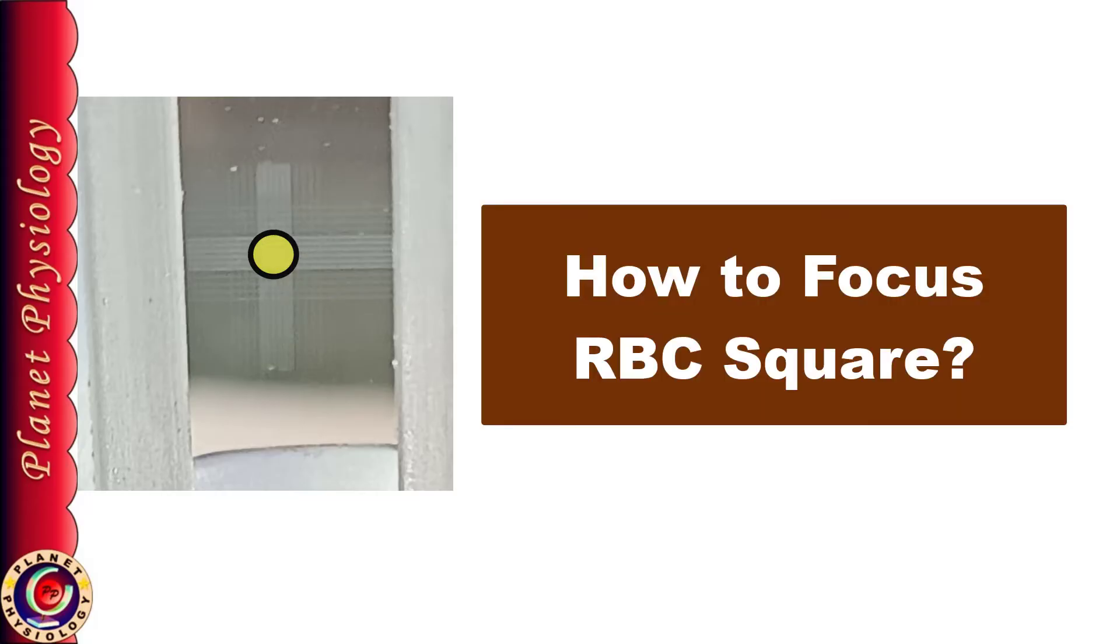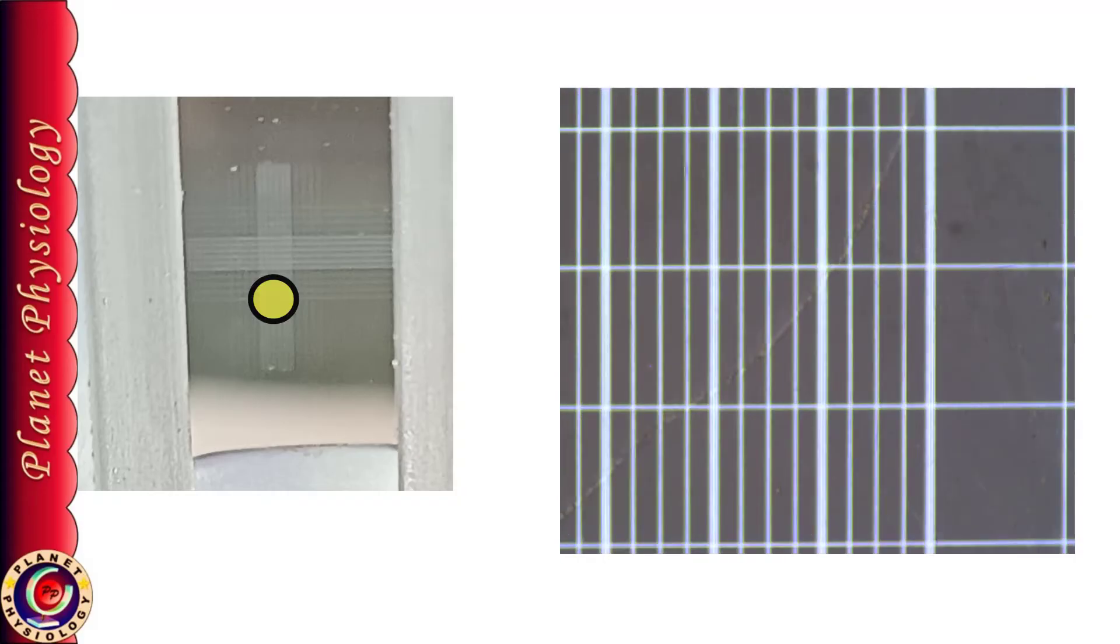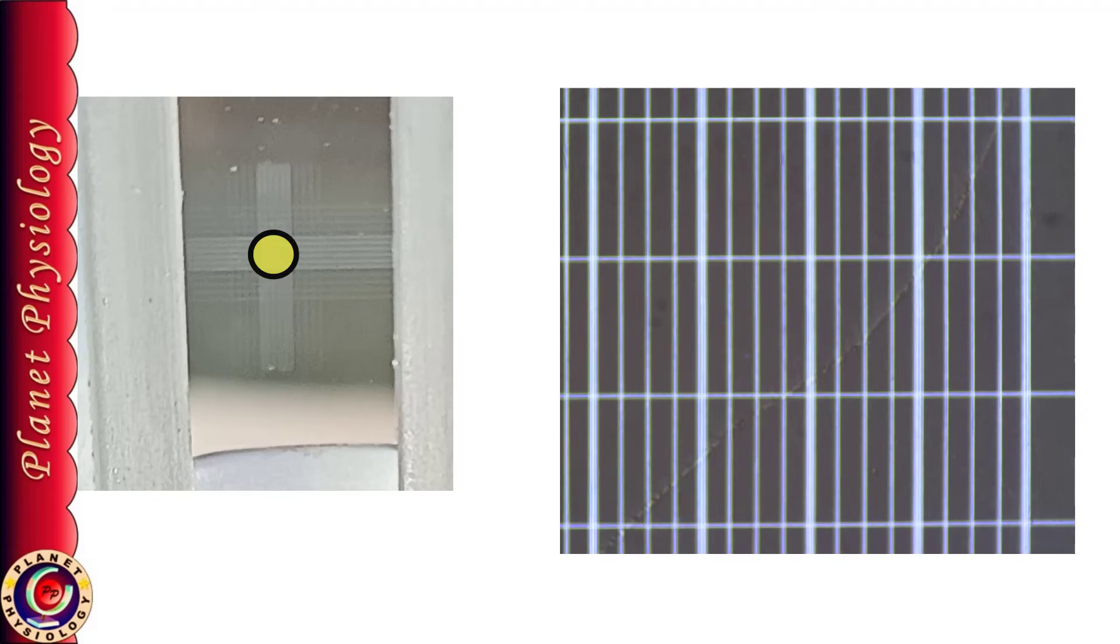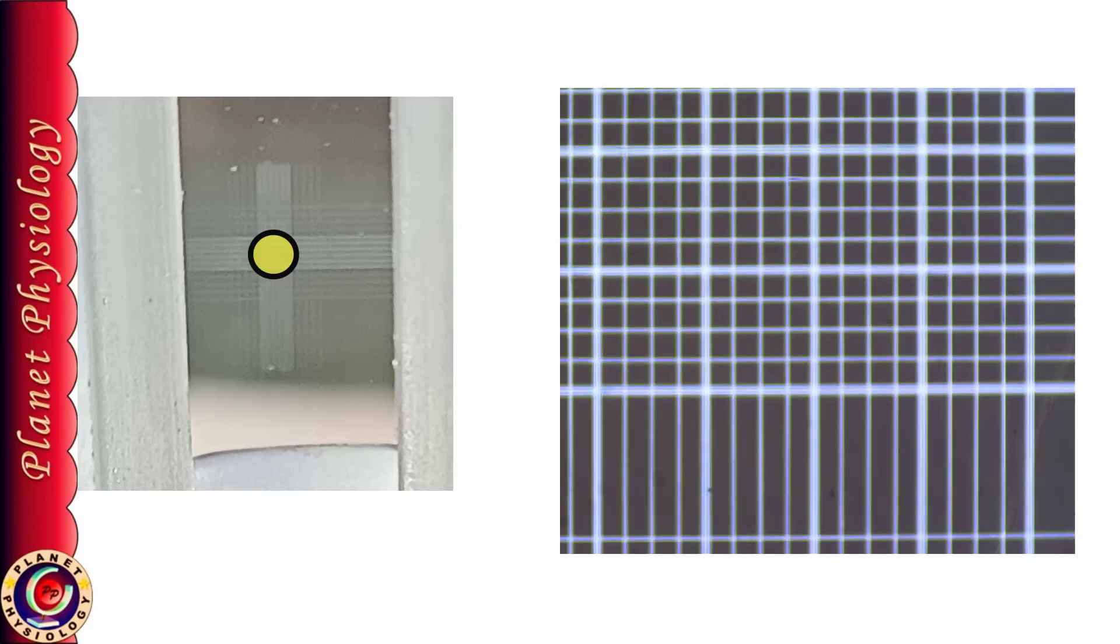If your aim is RBC count, then you need to focus RBC square under the low power first. For this, move your stage to focus the part of the grid between the WBC squares. Here you are observing only the rectangles and not the squares.